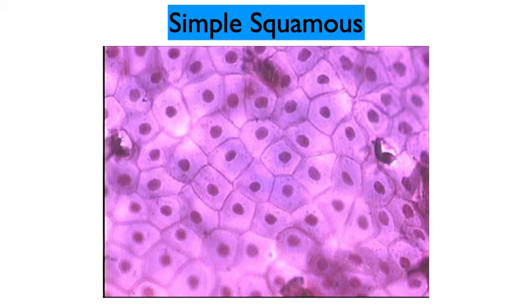You've seen this also, another key one that readily comes to mind are the walls of blood vessels, like in the capillaries, where you've got the lining of the blood vessels made up of simple squamous cells.